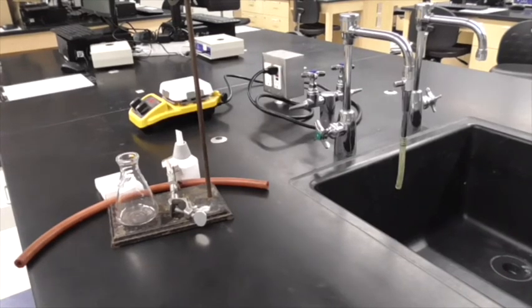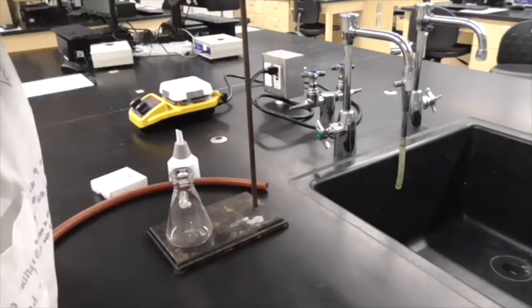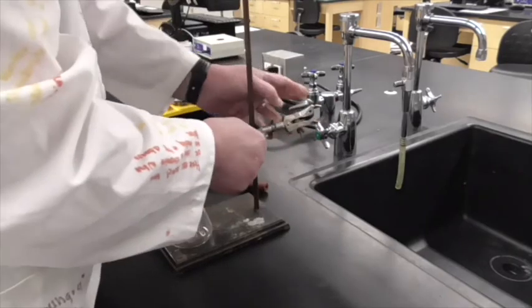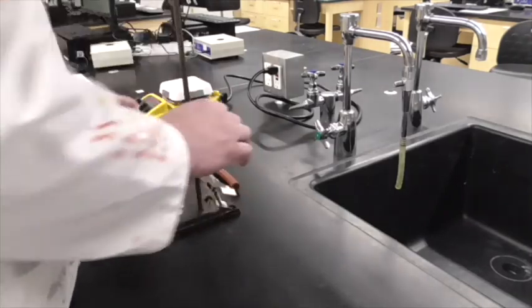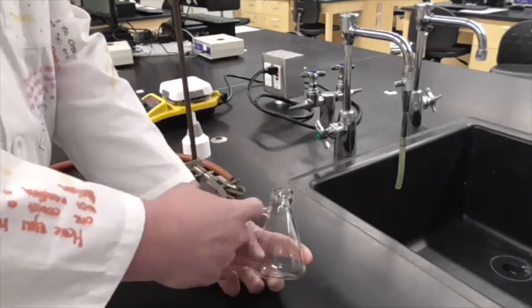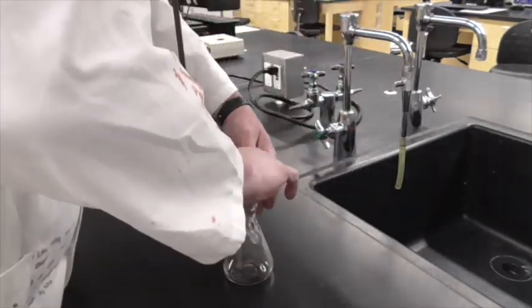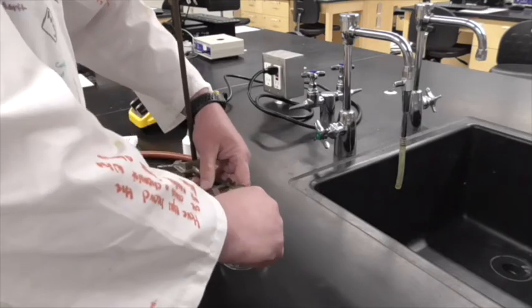Right, so while that's sitting in the ice bath and we're letting that cool a little bit, I'm going to set up the filtration. We're going to put a clamp here. I'm just going to turn it around this way actually to make things a little easier. And that clamp is going to hold our sidearm flask. And you can see the sidearm flask has a side arm to it, and that's where we're going to attach the vacuum. So I'm going to put that in our clamp just to hold it steady while we're doing the filtering, because we don't want everything to spill.